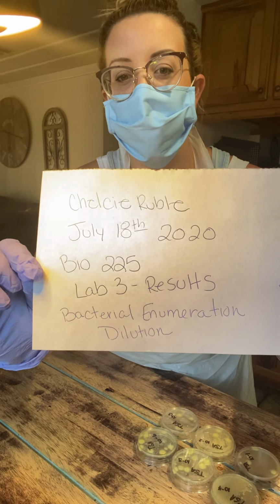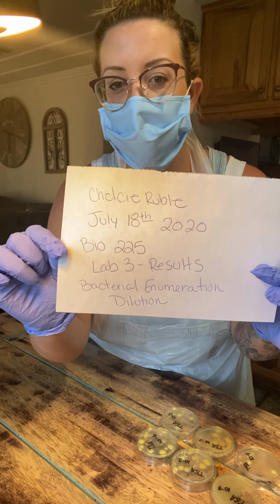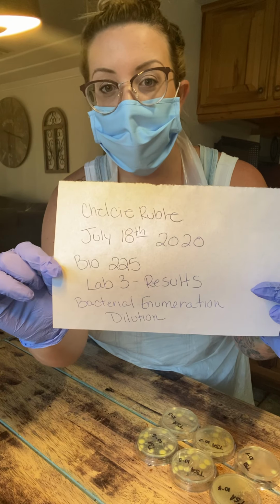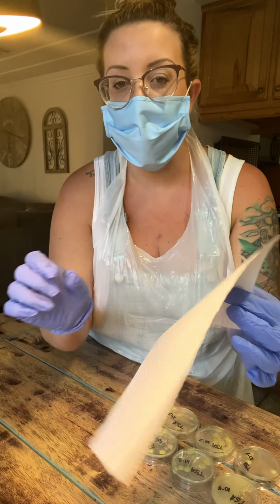Today is July 18th. This is Bio 225 Microbiology. The lab that I'm doing today is going to be basically the results for bacterial enumeration dilution.